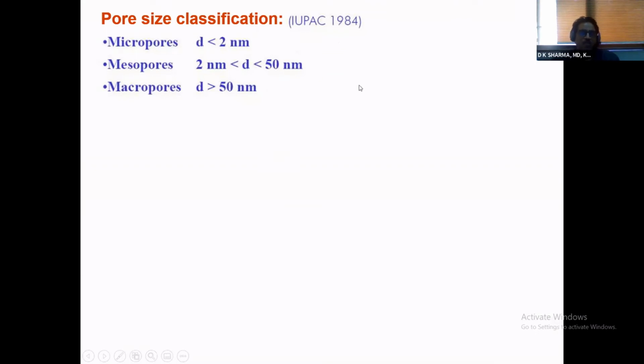The end of the mesopore limit is due to another reason. They say 500, and I think we talked about it yesterday, at least I spoke about it for some time. At around 500 angstrom, which is around 50 nanometers, as I said.